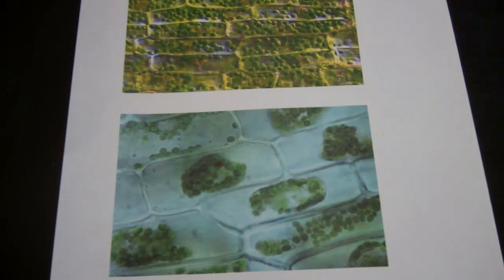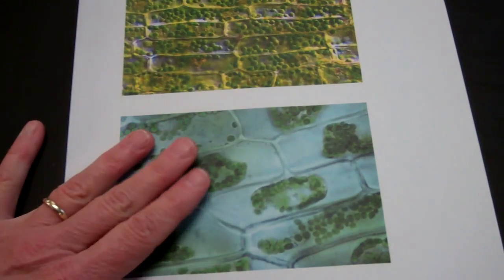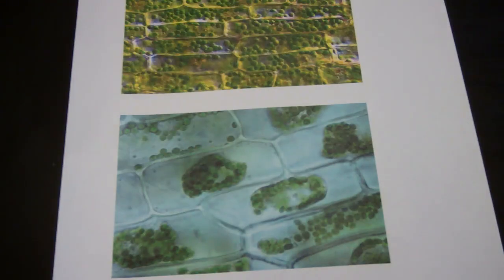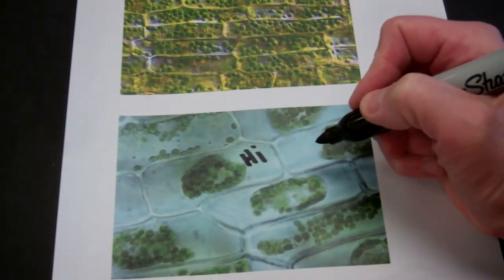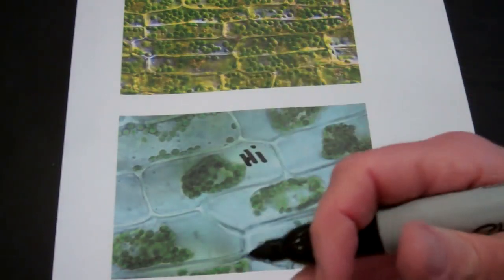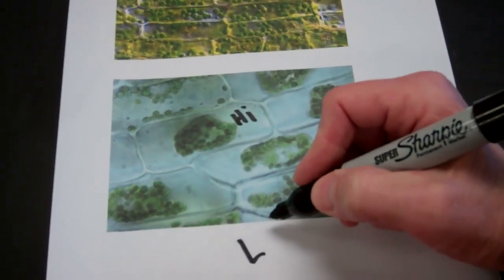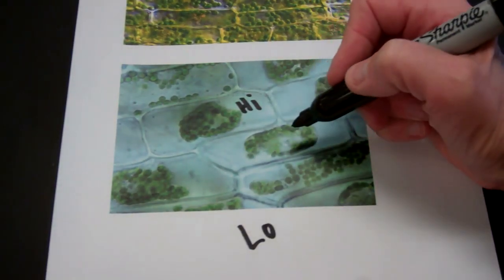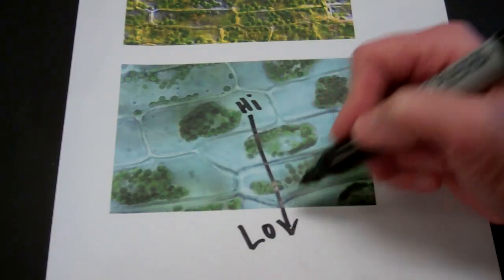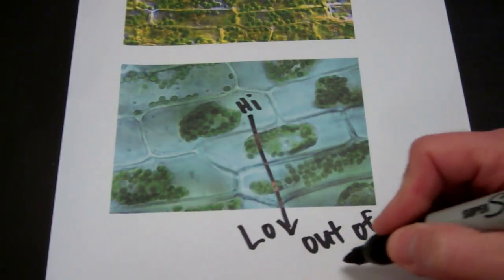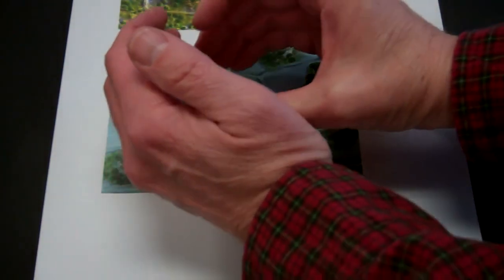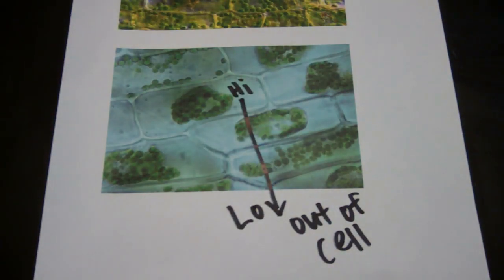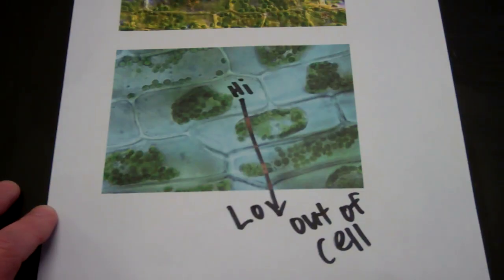So, when the cell looks like this, this tells us that water has moved out. Well, why did it move out? There was a higher concentration of water on the inside of this cell and a lower concentration outside of the cell. And so, the water is going to move from high to low. That means it's moving out of the cell. And as it moves out of the cell, the cell membrane shrinks into the middle of the cell. So, that is what happens when we put our cell into salt water.